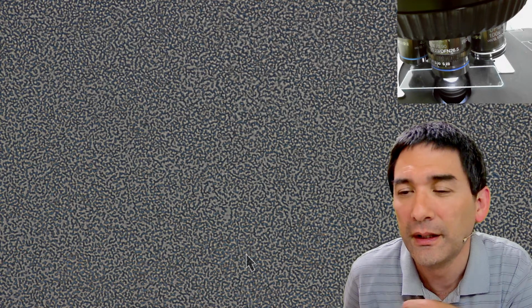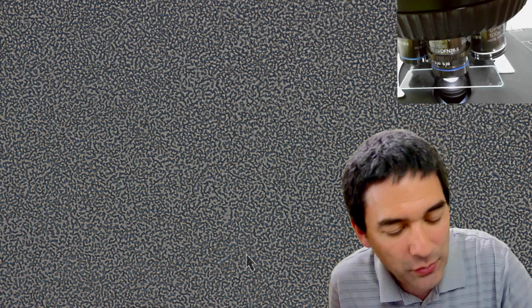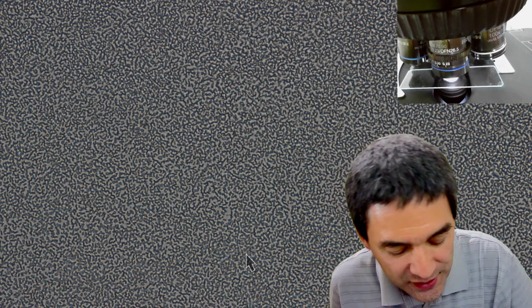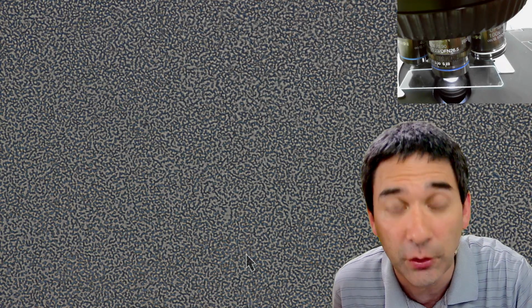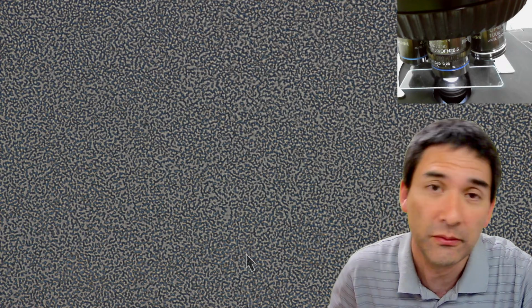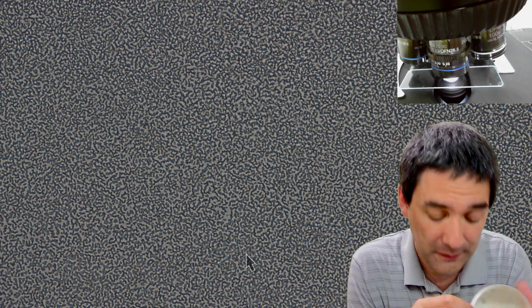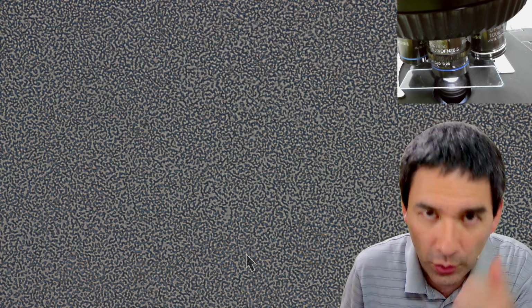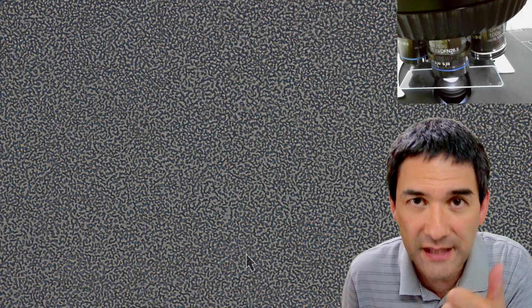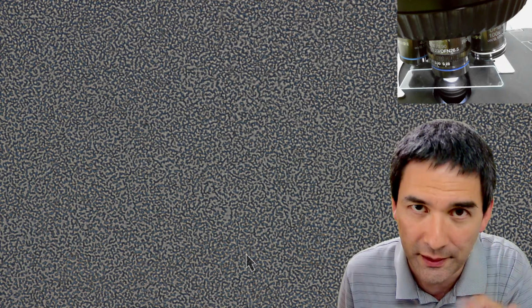Can you safely grow this at home without any danger? The reason why I showed you the whole thing with the Petri dishes is because there are so many YouTube videos out there where people do stuff that I consider pretty dangerous, or at least something I wouldn't do. If you're growing E. coli bacteria, E. coli are known bacteria and they are safe, so they're in biohazard category 1.